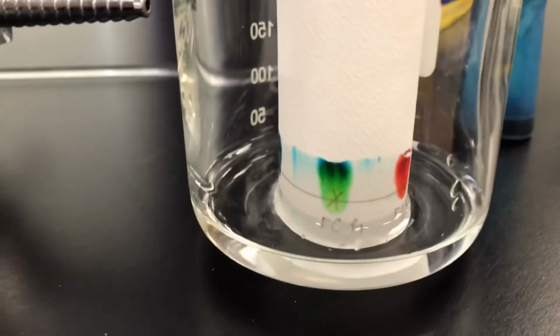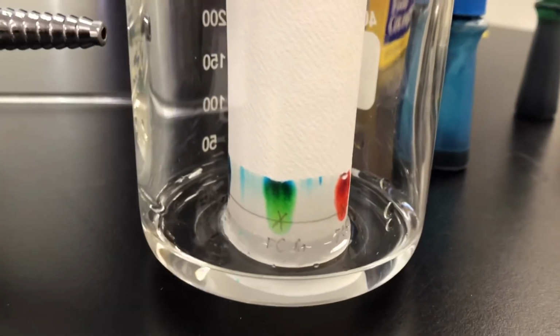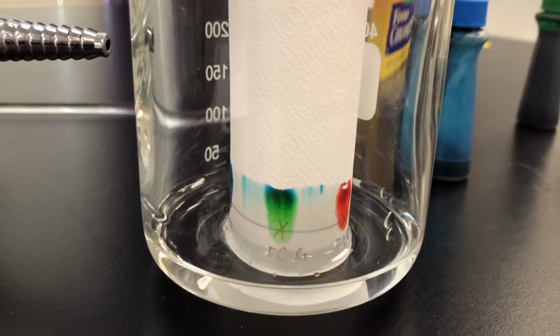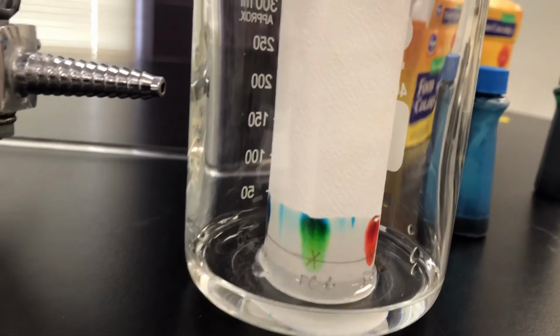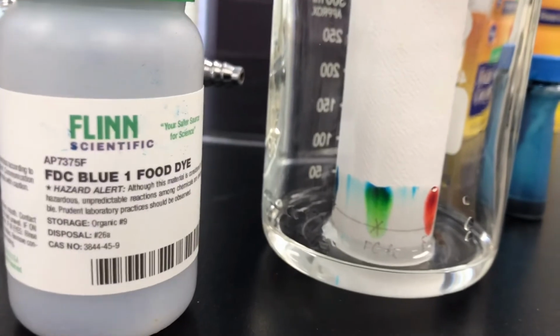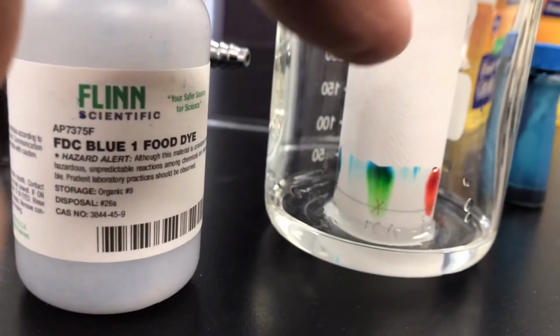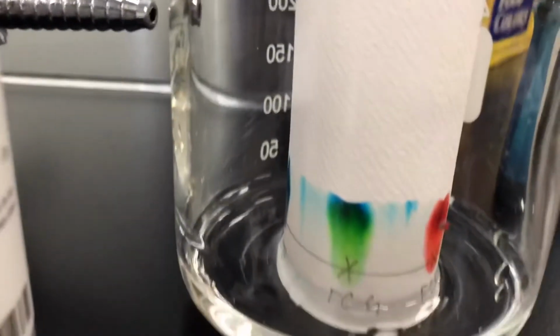Just wanted to show you here on the food coloring, whenever I had these papers laid out, the blue FD&C blue dye number 1, which comes in a super fine powder, whenever I was mixing this up, I was mixing it up in the vicinity of the paper that we're using for the chromatograph paper, and it did get some blue in there.